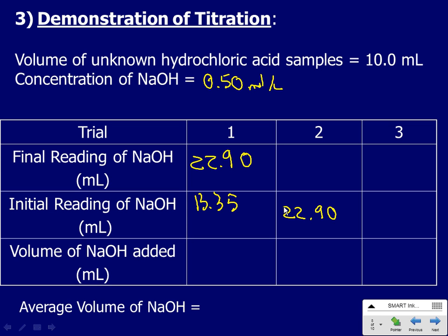So now I want to really slow down because I want those drops to come at a very slow rate, and this is where I lose it. This is where my patience goes. So I'm trying to open this. There we've got a partial drop coming out. There we go. So now we're doing slow drip, drip. There was one. Disappeared. Next one, next one. Stop. No. Here we go. Drop. Another drop. Another drop. Okay.